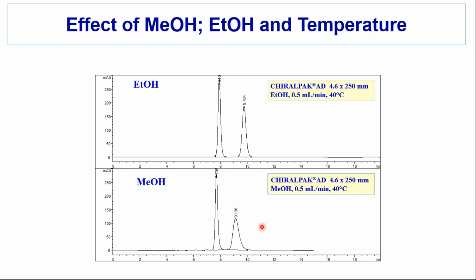The other is, if this is your analyte minor component, and this is your main component, you get better dynamic range because this is probably twice the peak height given the same amount of material. So if you make this at a higher concentration, this peak will be big, but the relative height of this peak will be taller than the relative height using ethanol. So there can be an advantage to having a broader, shorter peak for your main component. And we found this by a systematic approach. It's almost trivial, but I think it was unambiguous.